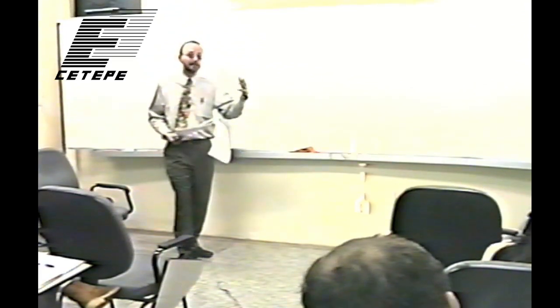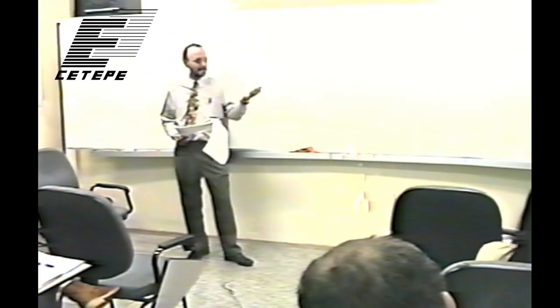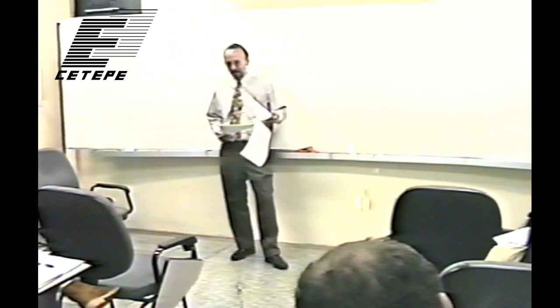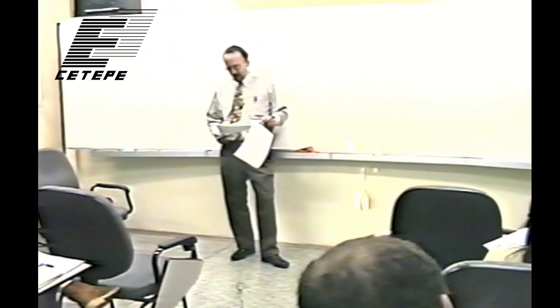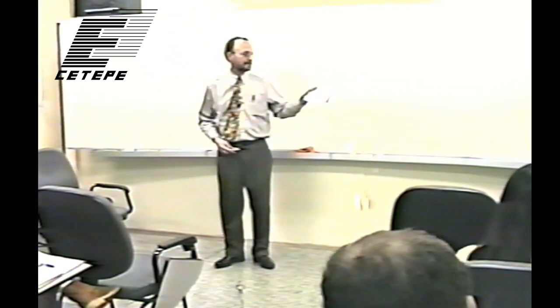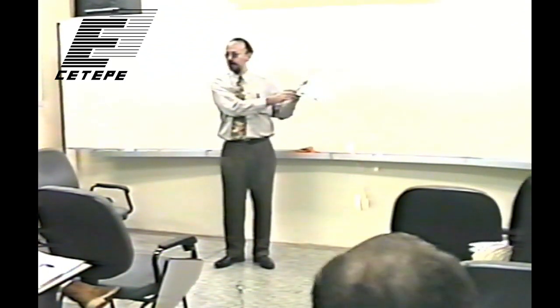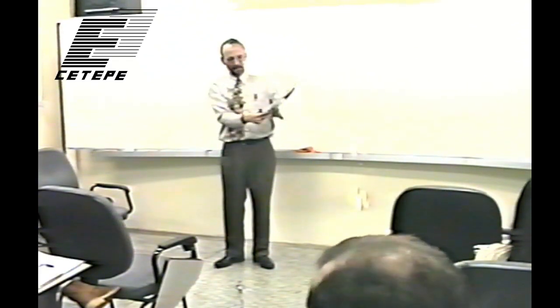It's a fundamental concept about image quality and resolution that some of you are probably very familiar with. You may have even measured it for some systems, and others, maybe you never heard of it. Have you ever heard of modulation transfer function? It's fine. I mean, it's an imaging thing. But it's a fundamental imaging thing, so we'll try to shed some light on it, or explain it a little bit, and how we measure it. And also, I really like these charts on pages 458 and 459 of kind of following the quanta through an imaging system, and we'll talk a little bit about those diagrams.